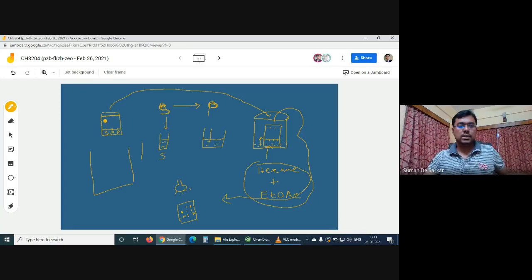Now suppose the starting material is here, ideal case. So the acetophenone case, which we have seen: the acetophenone is here, and the product is a little bit below. Sorry, the product is here, below. This is the spot. For RF value calculation, this starting material and product, these two are important. So RF value is nothing but this thing.